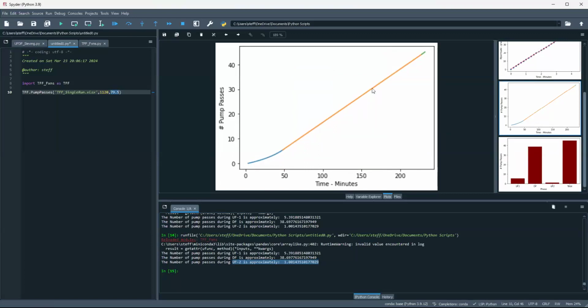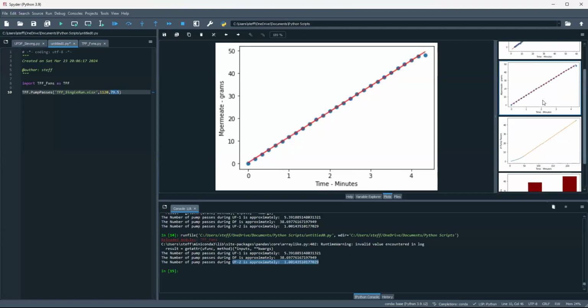And then this orange line is diafiltration. It's linear there. Your flux is generally constant during diafiltration. It can change depending on if your protein's happier in the diafiltration buffer, or maybe it'll go down if your diafiltration buffer is more viscous. It can change, but it'll often stay pretty constant, which is what we see here. Stays flat. And then the second concentration is so short that it also stays flat.